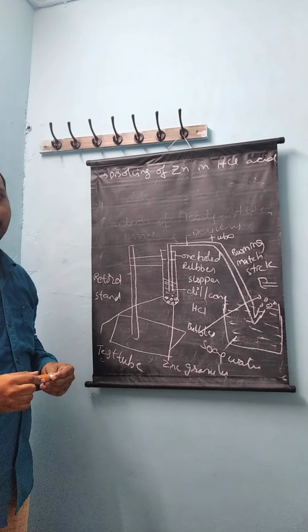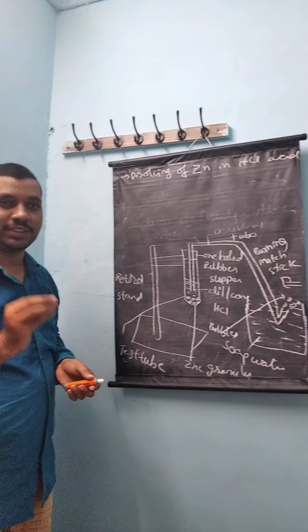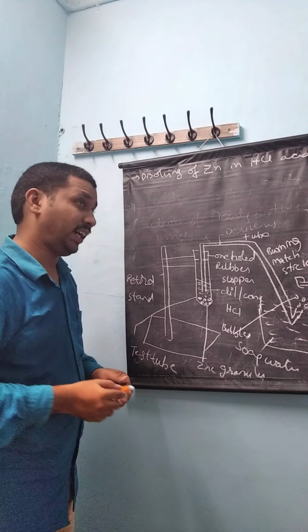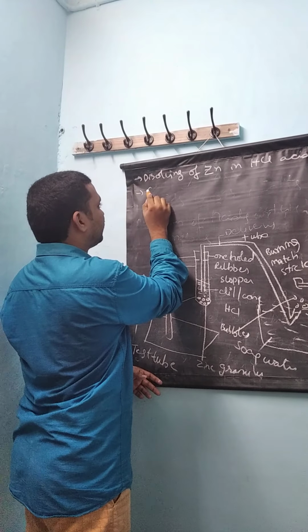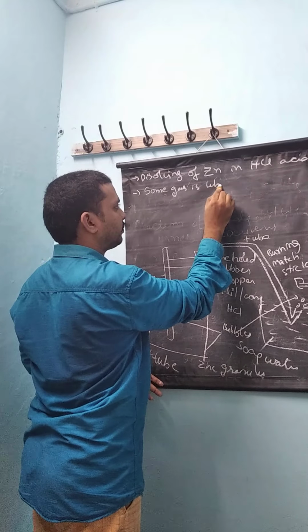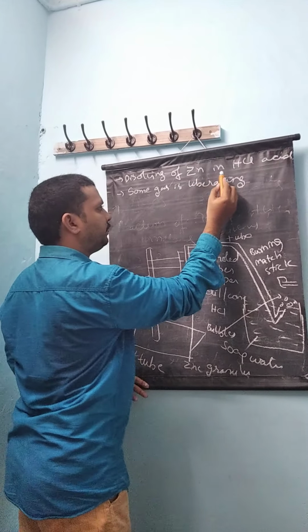Slowly we will observe the dissolving or disappearing of the zinc granules in the test tube. On the other hand, we observe some gases liberating from the test tube.